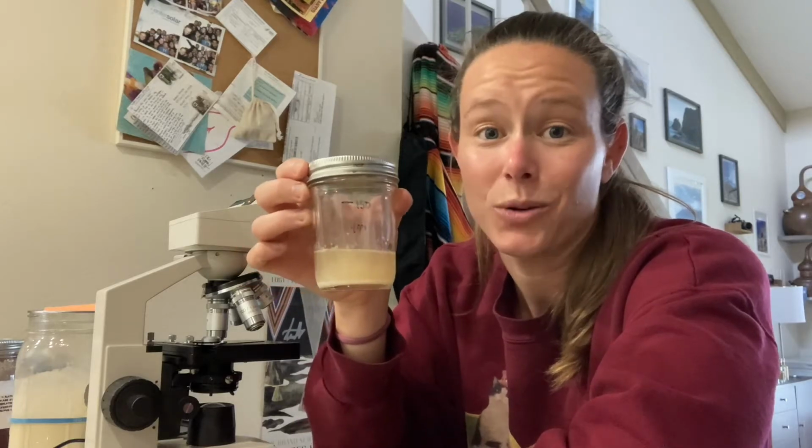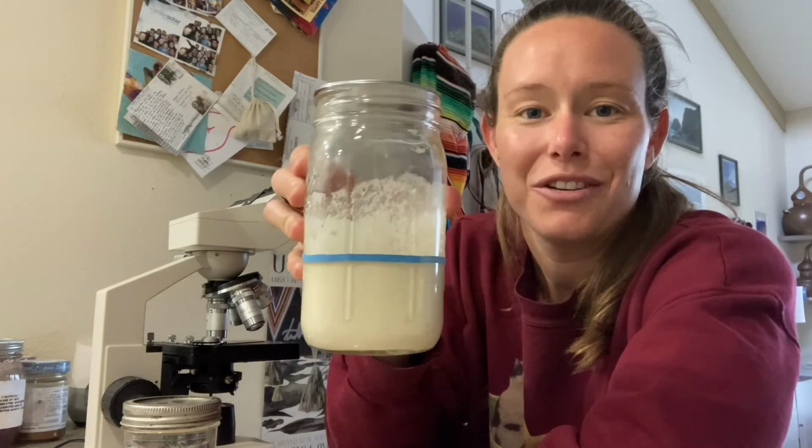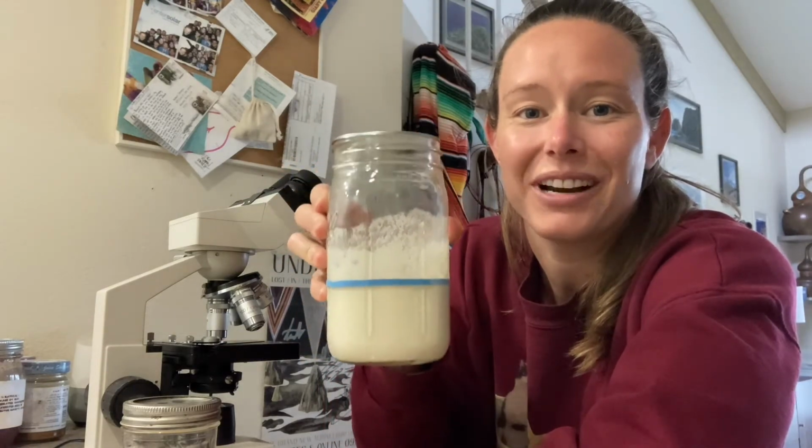This is my hooch. Hooch is a slang term for booze. However, it's also what they call the liquid that forms on top of your sourdough starter. It's alcohol, so appropriately named hooch. And yeah, I'm about 2 years late to the game. I just started a sourdough starter. Here's my freshly fed sourdough starter right here.